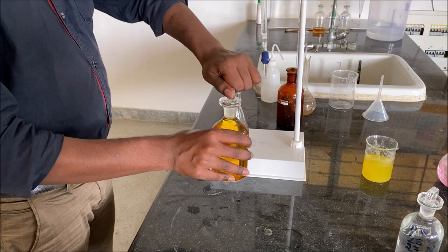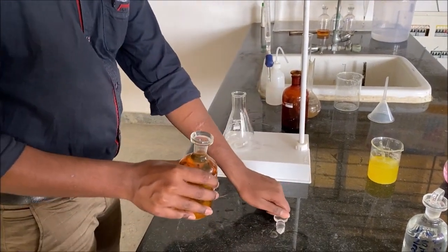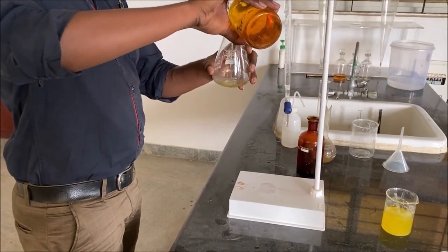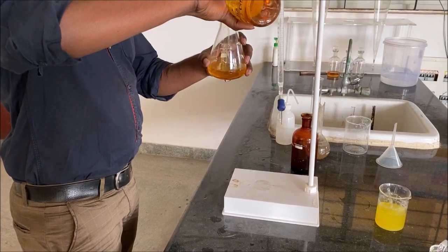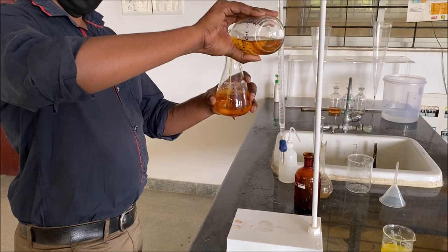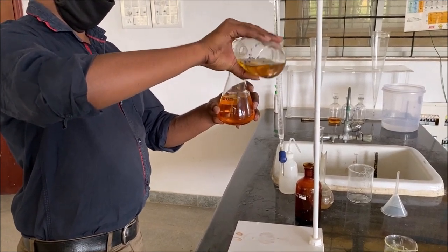About 203 ml of the contents of the BOD bottle is transferred into the conical flask. Since the graduations are already marked on the conical flask, the 203 ml is measured in the conical flask itself.